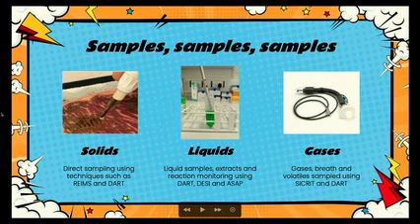Developed by Zoltan Takats, who's another alumni from Graham Cooks's lab. Developed that to see if it was possible to identify biomarkers for cancer, and they could then identify the margin between healthy tissue and cancerous tissue as the surgeon was cutting the tissue sample.